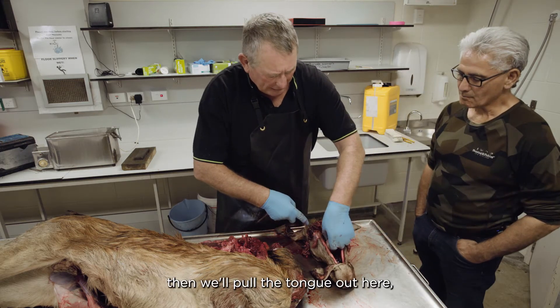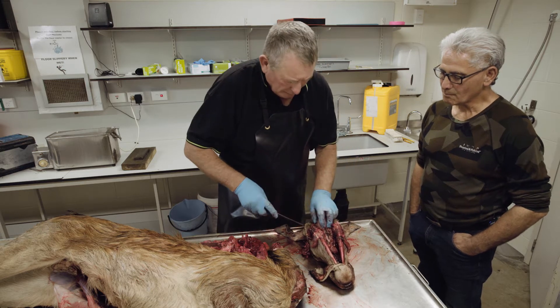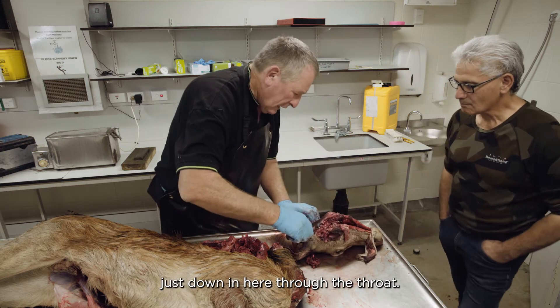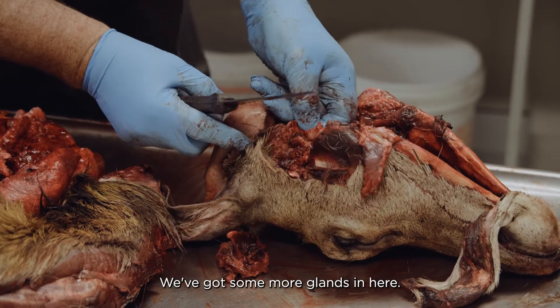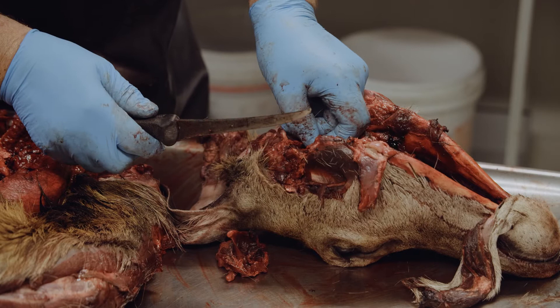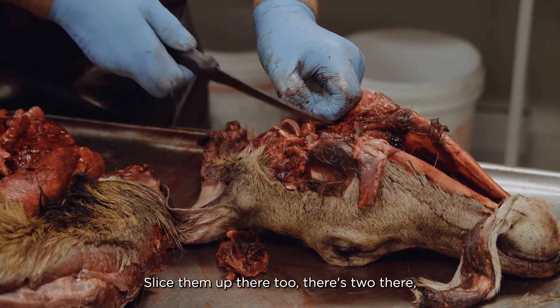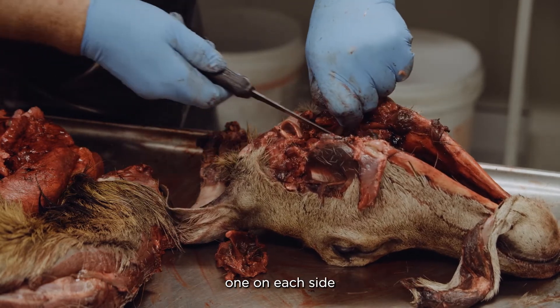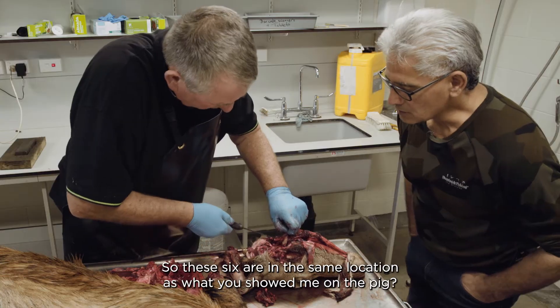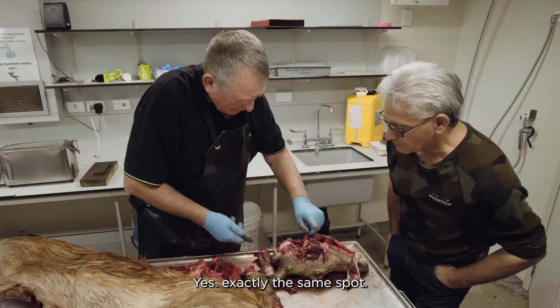Now we'll pull the tongue out. Just down in here through the throat, we've got some more glands. Just slice them up there too - there's two, one on each side. These glands are in the same location as what you'd find in a pig - exactly the same spot.